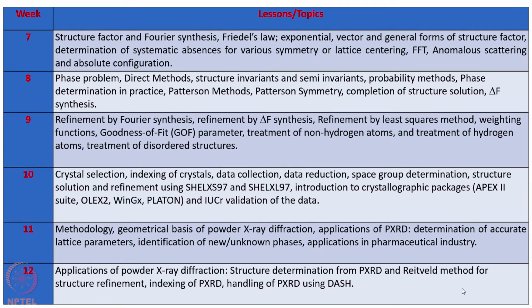Then we will move towards the end of this course to the methodology and geometrical basis of powder X-ray diffraction, applications of PXRD, determination of accurate lattice parameters using powder diffraction and different applications of powder X-ray diffraction methodologies and its application in the pharmaceutical industry. Application of powder diffraction, structure determination from X-ray diffraction data and Rietveld analysis also will be touched upon towards the end of this course.